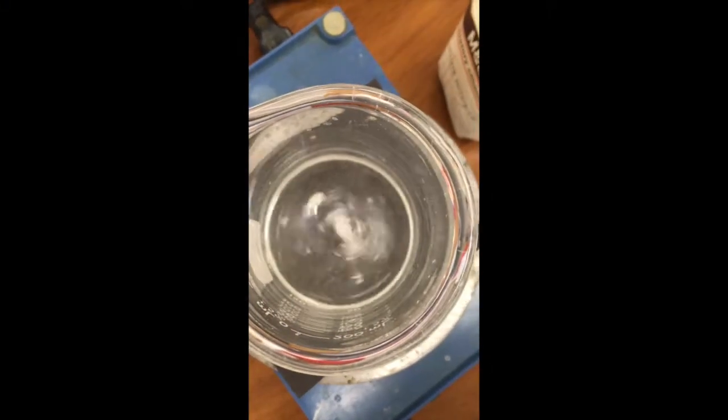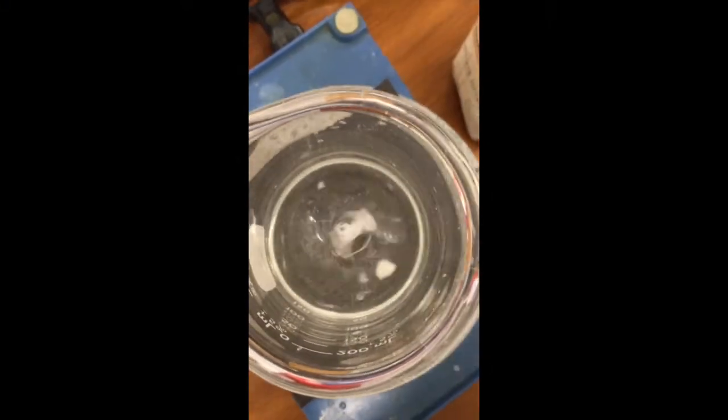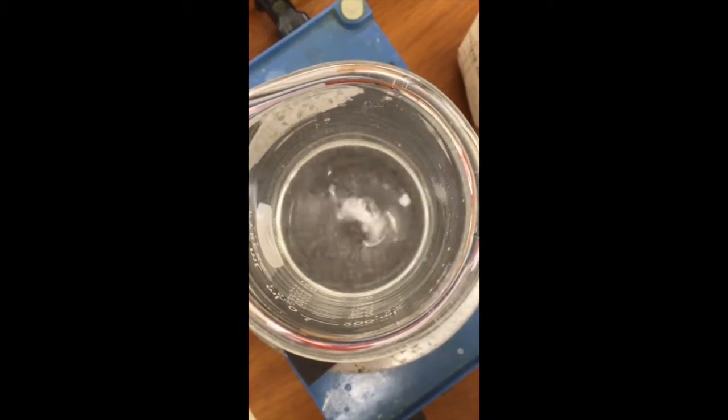Firstly, I prepare a concentrated saturated solution of the sodium nitrate by spooning in spatulas of the solid into water. The solid is added until just a few crystals remain within the solution. This is your saturated solution.